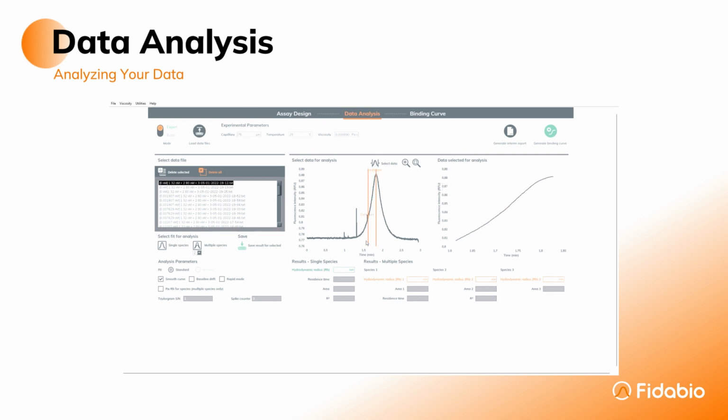You select the time interval that will be fitted by selecting Data Start and Data End. If the baseline is drifting, this can be fixed by toggling the relevant tick. The noise reduction can also be toggled on and off. You fit your data by clicking single species or multi-species. In this case, there are 2 species, so we will use this fit. You can save the result by clicking the relevant button. This procedure is then applied to all data points.